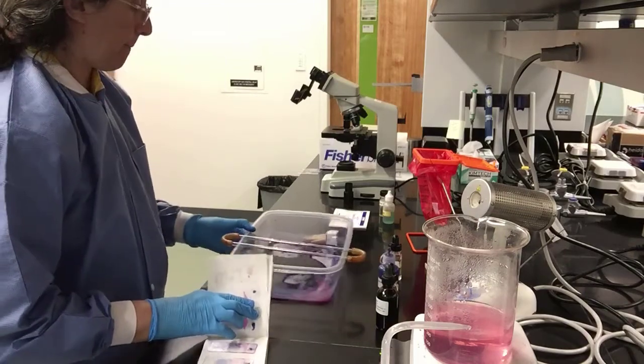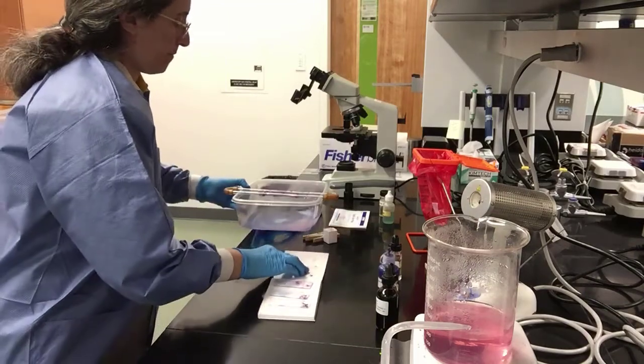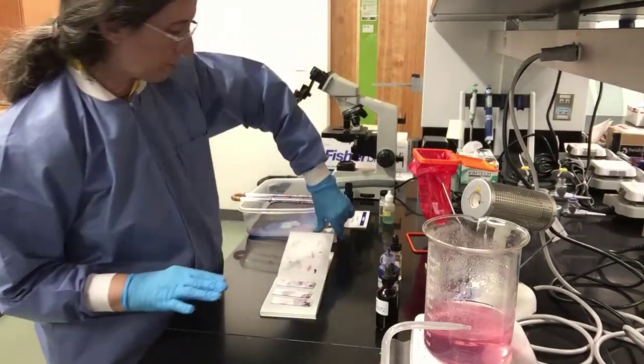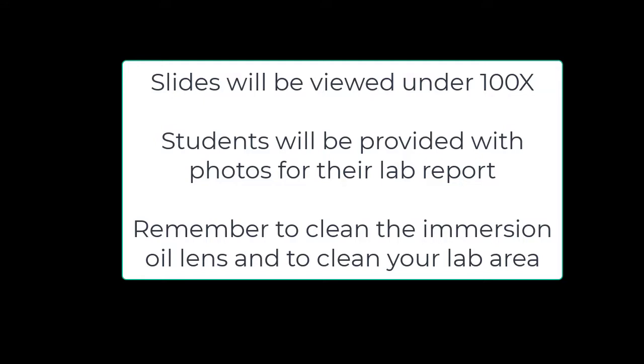We are now ready to place cover slips on our slides and place them under the microscope. Slides will be viewed under 100x. Students will be provided with photos for their lab report. Please remember to clean the immersion oil lens and to clean your lab area.